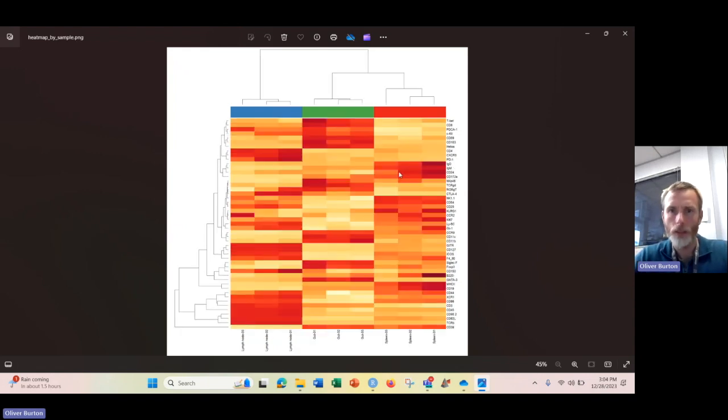That makes sense, right? We can see that split up by individual samples, and we can see that the samples are grouped together. And this is the median expression of each marker in each sample. So we have a nice little dendrogram across the top showing us that the lymph nodes group together and are an outgroup from the gut and the spleen. And this makes sense because spleen and gut both have myeloid cells in them. They have DCs and macrophages, eosinophils, and those aren't really present much at all in lymph nodes.